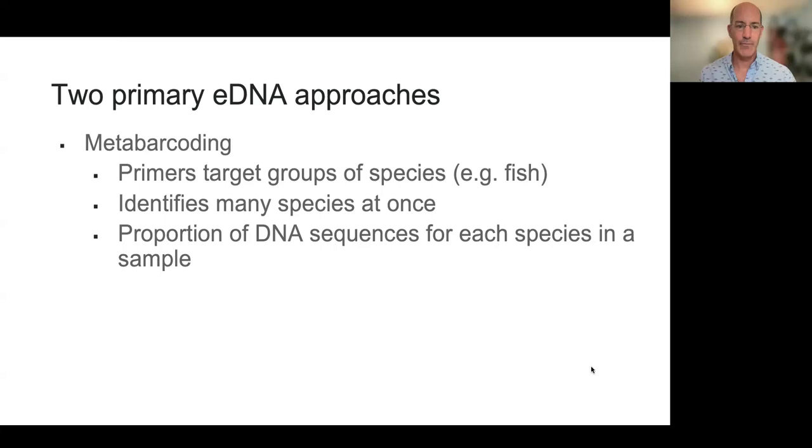The nice part about this metabarcoding approach is that it lets you look at a lot of species at once. Like, what are all the different fish that are in the Chesapeake Bay? If they're there, can I find them and figure out what they are? And then the data you get back tell you how many sequences of DNA you get. You might take some samples and get back thousands or even millions of individual sequences of DNA from your sample. And this will tell you, 50% of them were striped bass, and 20% were white perch, and 10% were something else, down to the rare things.